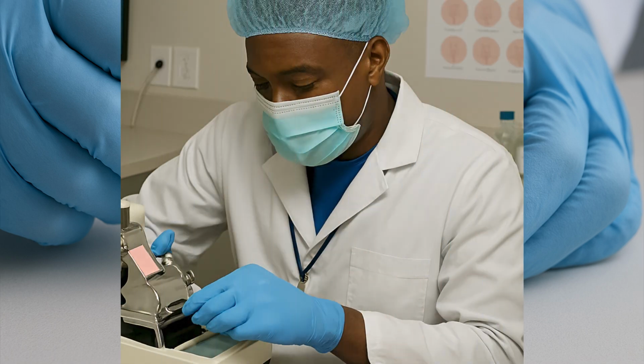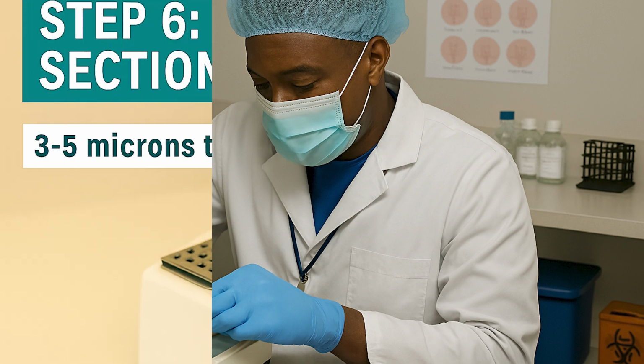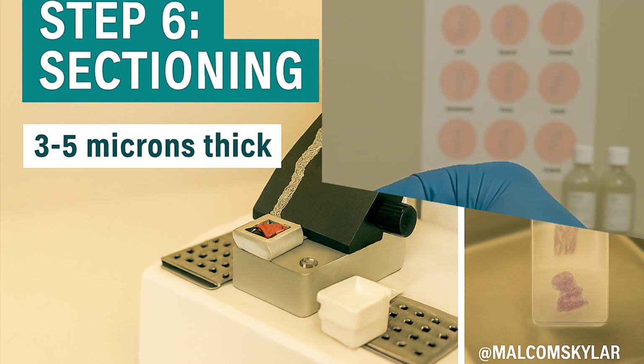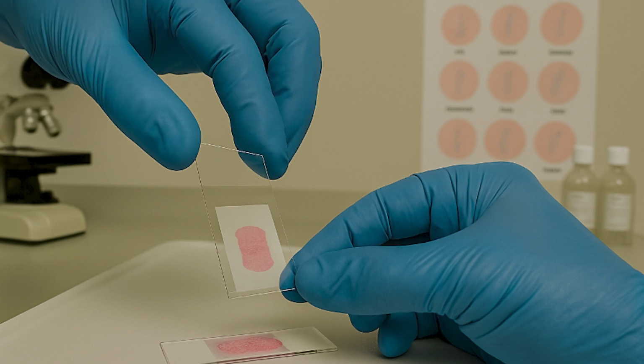Now comes the art of microtomy, cutting ultra-thin slices of tissue using a microtome. Each section is about 3 to 5 microns, which is thinner than a human hair. The ribbons of paraffin are floated on a warm water bath and then picked up on a glass slide.